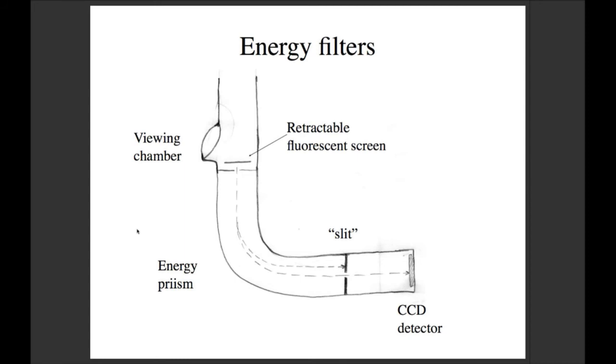Huh. So it's also hard, you would have to have an interplay between different manufacturers. If you make cameras that go in the column, you have to place it within the column, so it'll have to be done during the build and design of the microscope. It can't be a choice. Unless you buy a microscope and you want a better camera with an energy filter. That's something, if it's post-column and separate from the system, you add on.